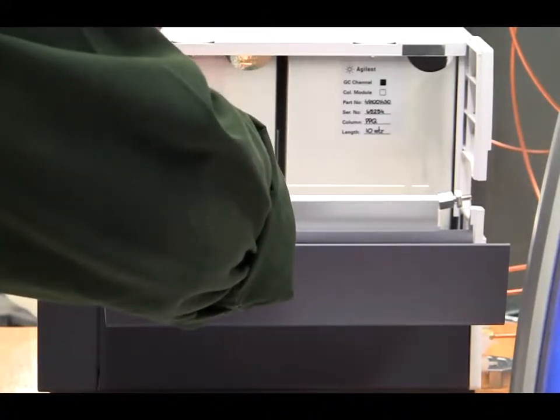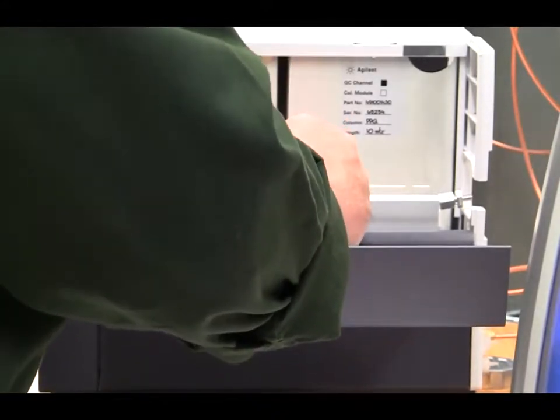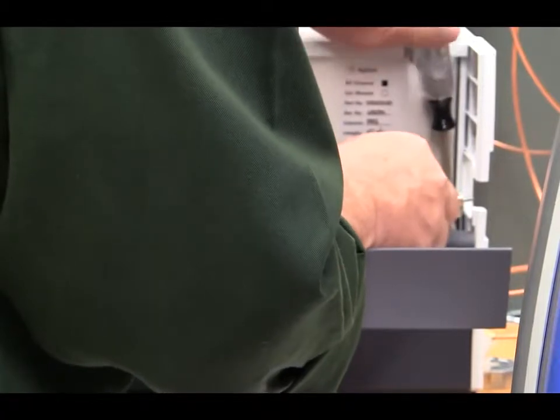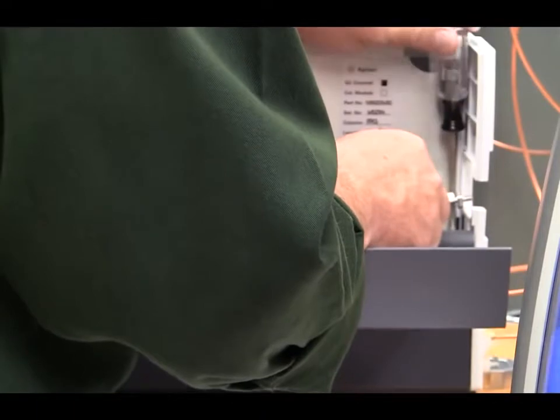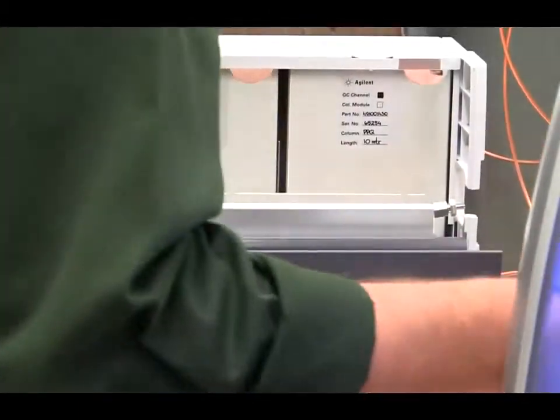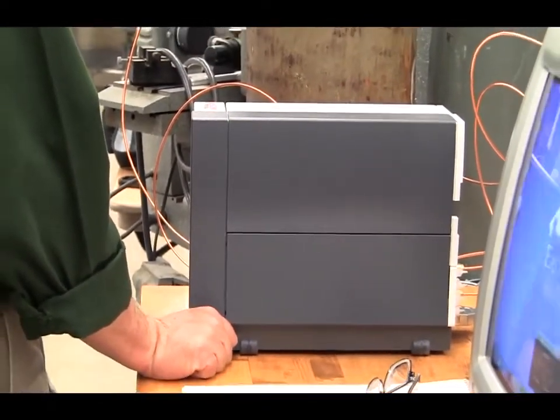In the chemistry department, I have a 490 model. A 4900. Yeah, this one's a 490. So they're familiar with running it then? They are, and I'm not. So I'm learning from scratch. I think I have a couple of Agilent products in the laboratory. Okay. This one will be designated for syngas analysis.